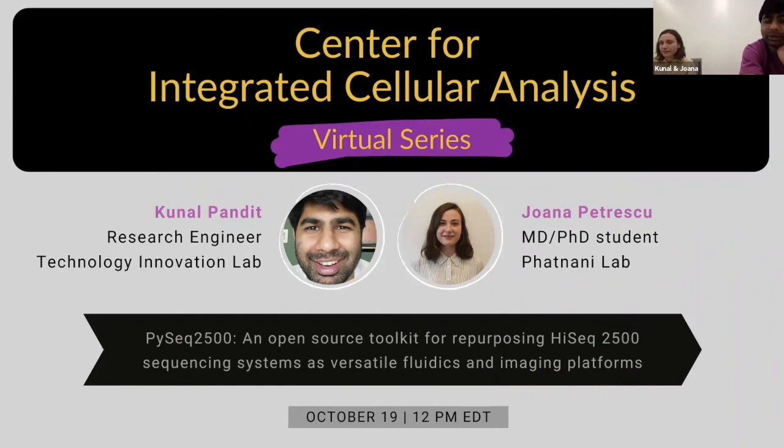We're also interested maybe in doing optical pooled CRISPR screens where we read the CRISPR edit in situ and measure a few antibodies too, maybe to get a morphology of the cell in conjunction with a single cell experiment. But yeah, we're thinking about multi-omic spatial omics methods and also using combined modalities with single cell.